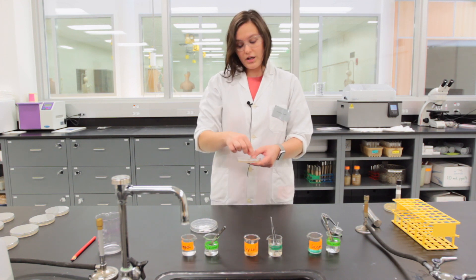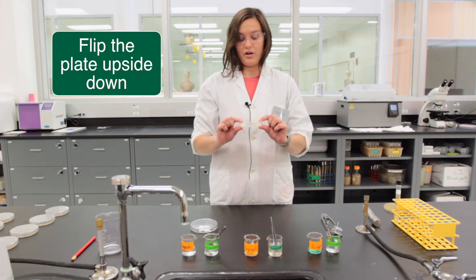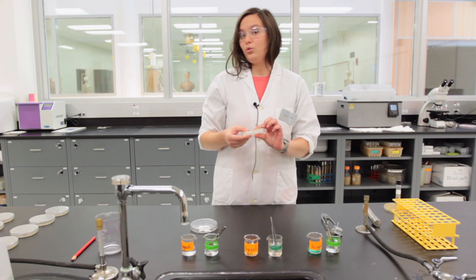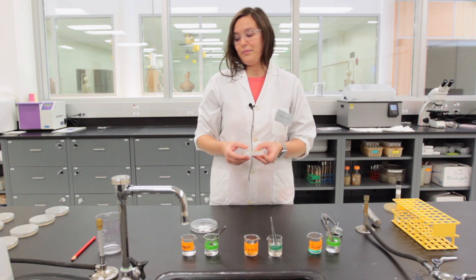Once you've finished putting all the discs onto your plate, you have to invert it. Do not worry — the discs will not fall from the media. Store them where your instructor tells you until next lab period.